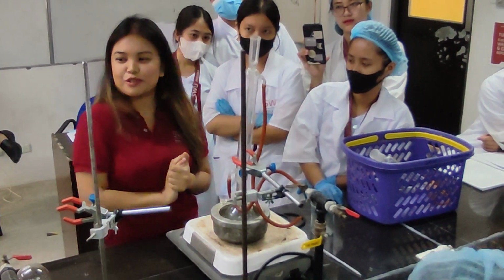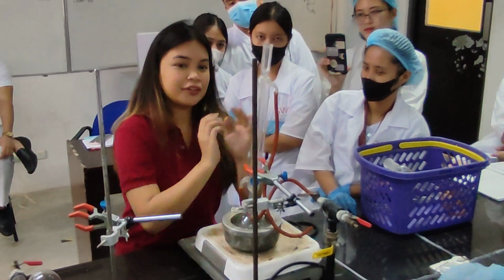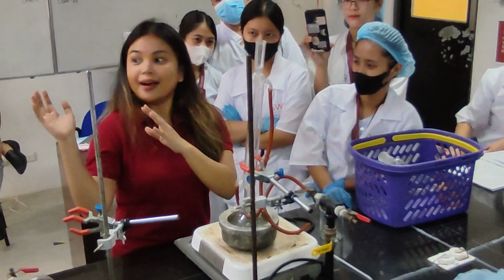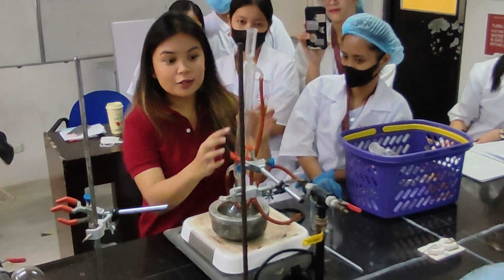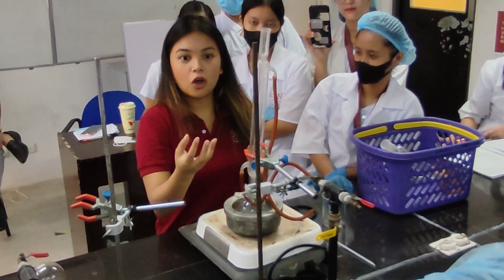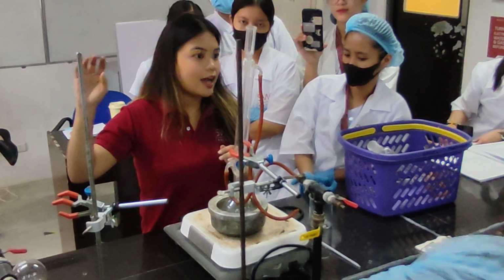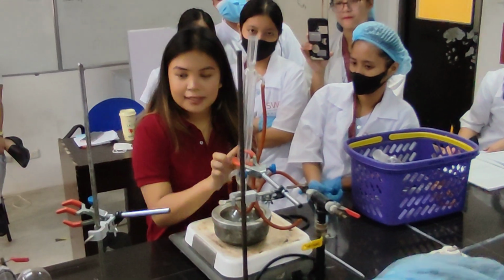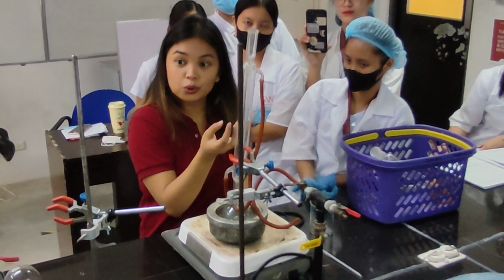The vapor goes up, and the cold water makes it return. It turns back to liquid. What happens in the condenser? Condensation. From what phase? Gas to liquid. When the gas rises, it condenses because there is running water, so it turns to liquid.